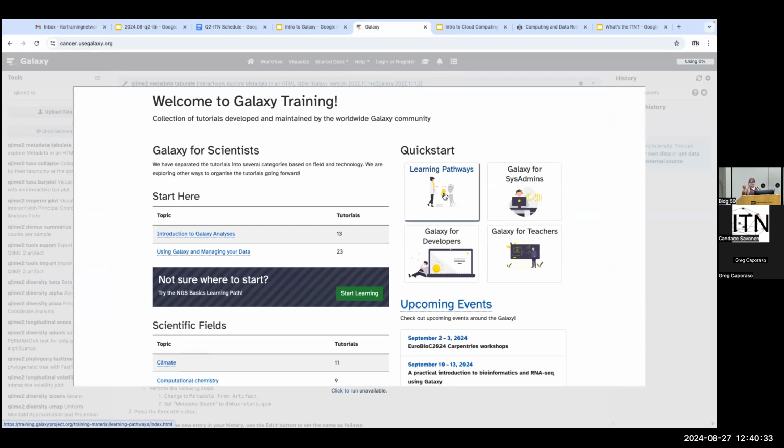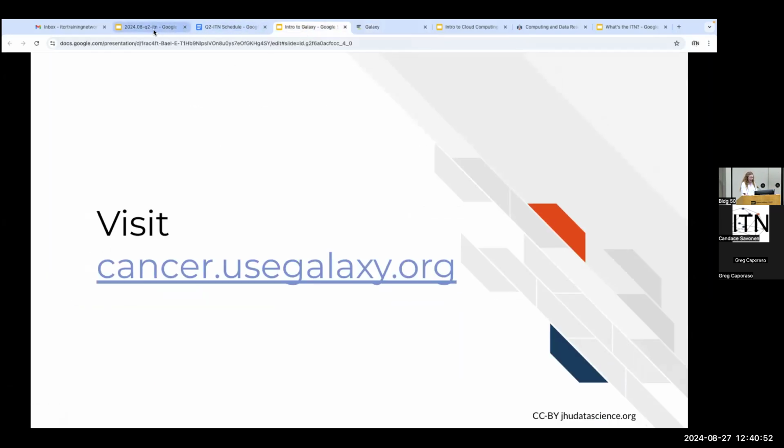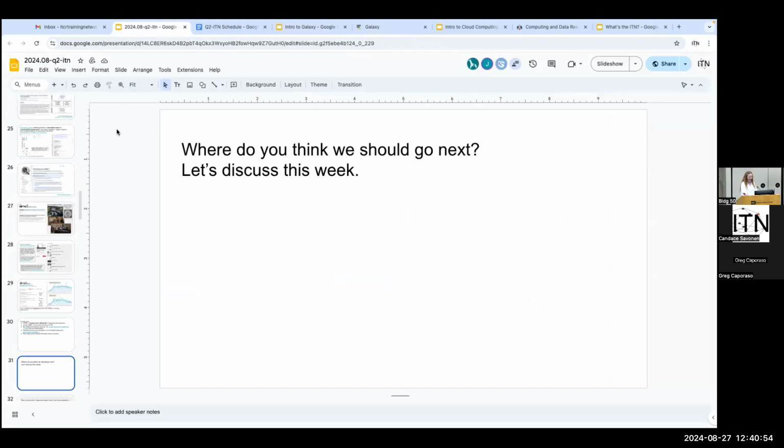So with that, I will hand it over to Hannah. Hello, everyone. My name is Johanna Hagen, and I'm going to be introducing the metadata and our study and getting you started with your first few commands on Galaxy.